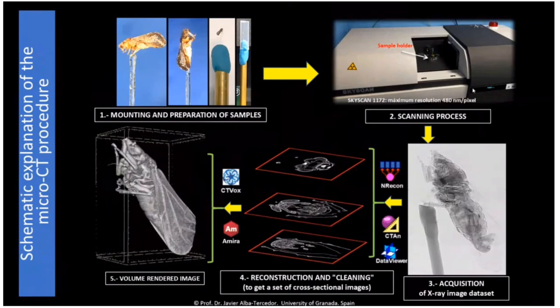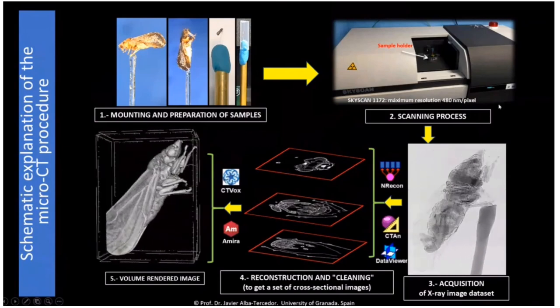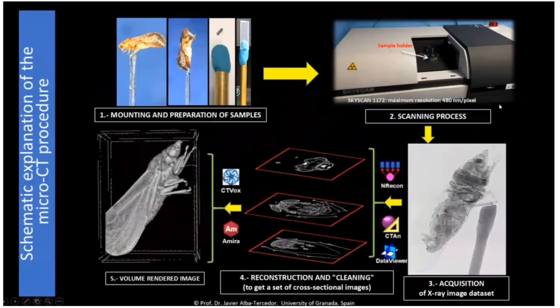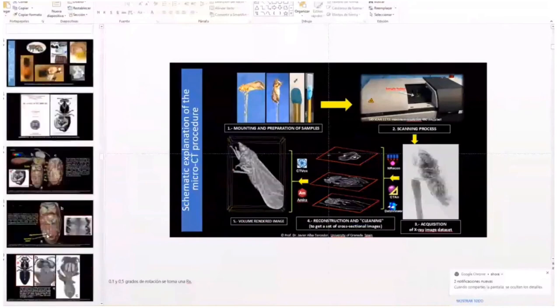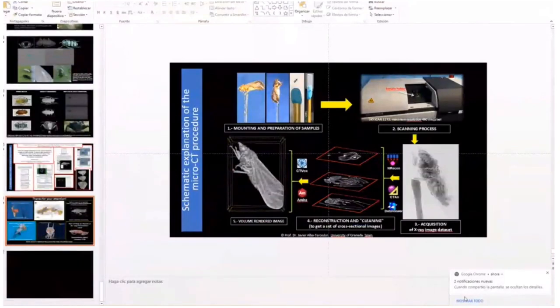If you would go to larger floor standing nano CT systems, then nanometer pixel size. So that would be the best possible, depending on the size of the sample. The larger the samples, the lower the resolution becomes.